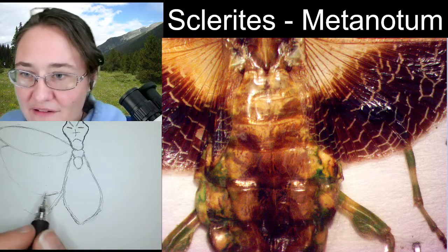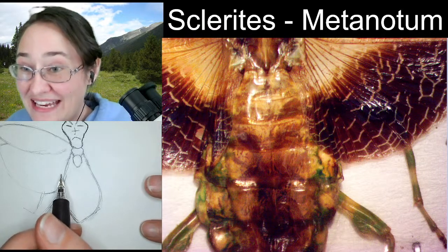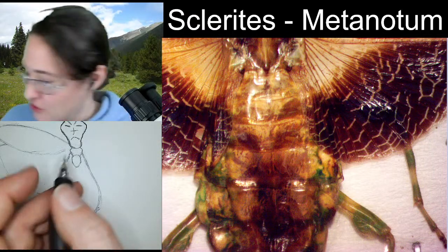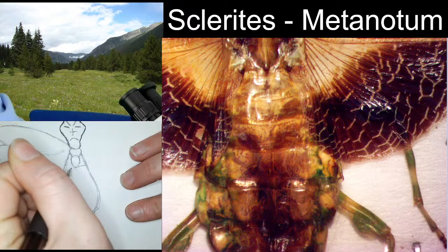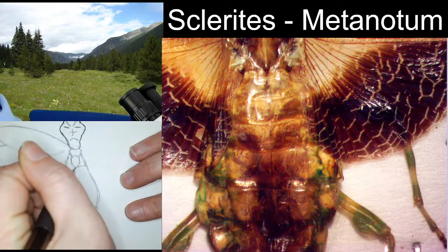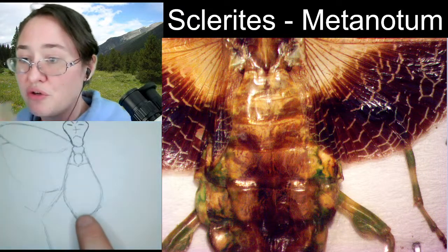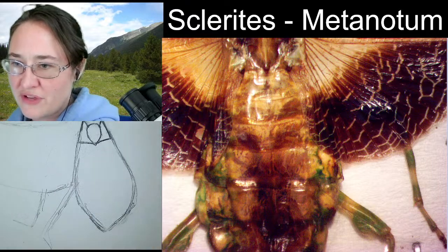Yeah. All right, so I'm actually going to subdivide this into 8, but the first abdominal segment is after the metanotum. So I'm going to find the tip of this metanotum here. I'm going to cross it over, and that's the actual true end of the thorax. All right, and then you're moving into the abdomen.